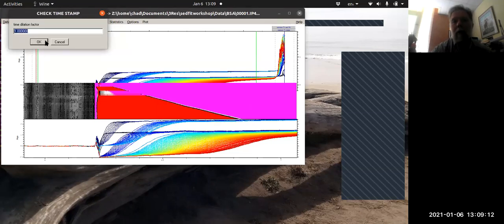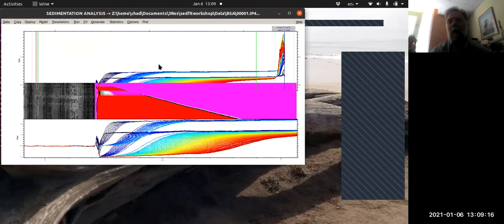This comes up as a time dilation factor. We're just going to leave it the way it is normally. It turns out Beckman, in their infinite wisdom, managed to screw up the timestamps on their data files in one version of the instrument. The old instrument we have is an XLI, the timestamps are fine. The new version we have is an Optima, the timestamps are fine.